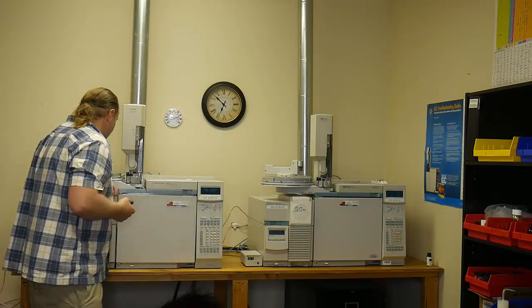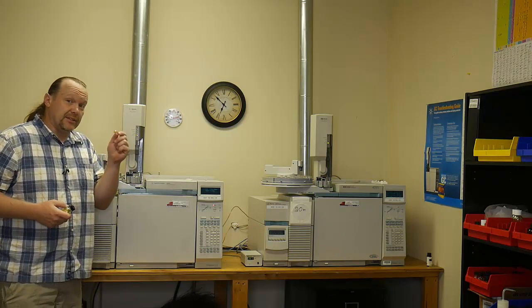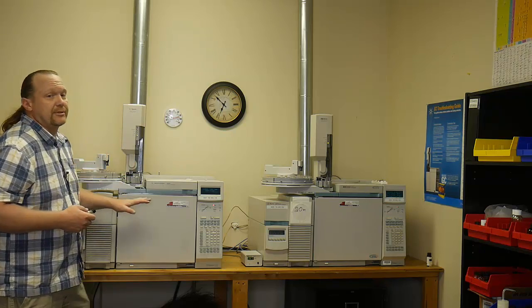Then we're going to grab another sample out of the same bottle and we're going to load it into this machine. This machine is going to tell us what percentage.